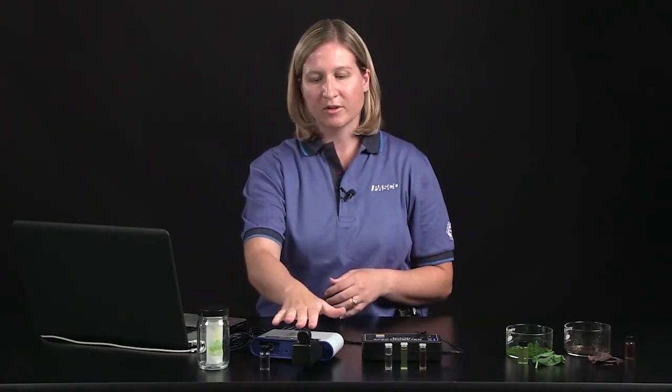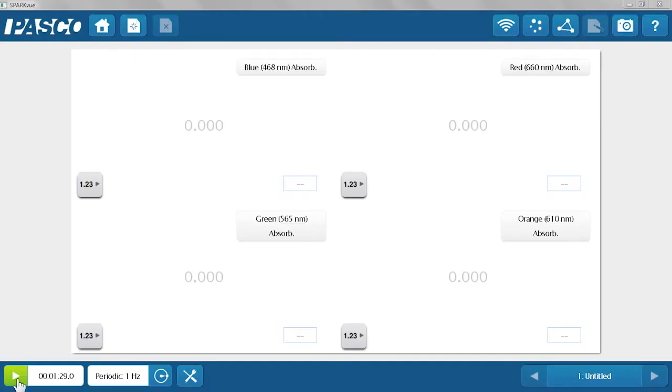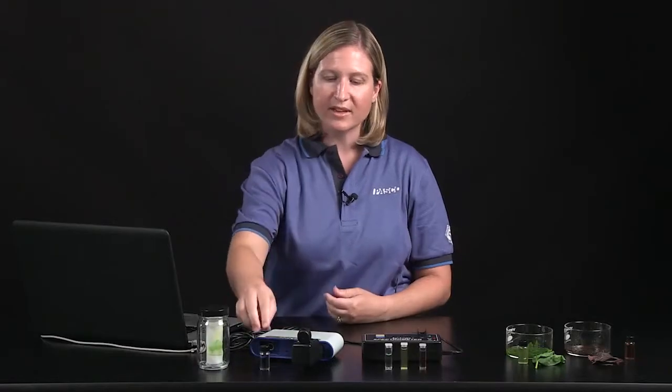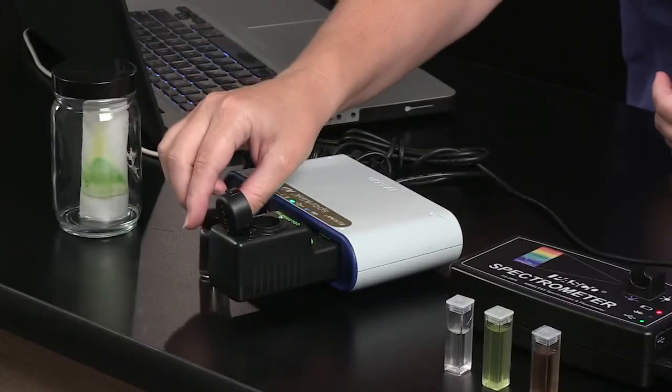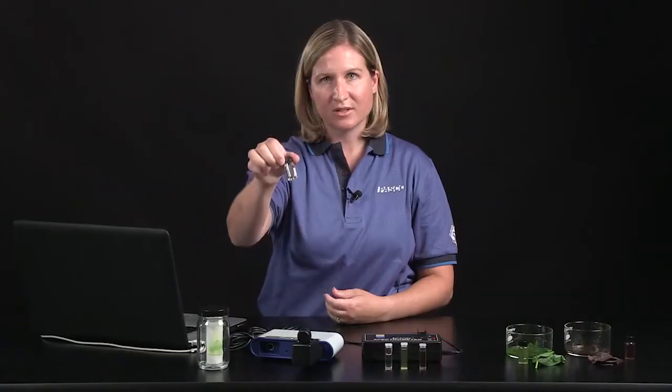First I'm going to start with the colorimeter. I have a colorimeter and a SparkLink Air attached to my computer, and I'm going to show you the data in SparkView. I've already calibrated the colorimeter — it's a simple green button calibration on the front of the sensor. I used a cuvette of ethanol as my blank because that's the substance I extracted pigments from.